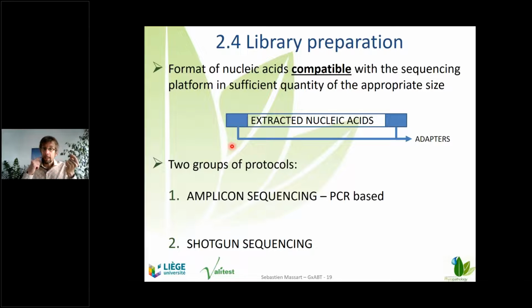This is done, for example, for microbiome studies. If you want to study the bacterial or fungal population, you will design primers that amplify a specific region: 16S for bacteria, and part of the 16S, not the whole currently, or ITS, the internal transcribed spacer, in fungi, for example, or COI for insects, whatever. You will amplify like a barcode and sequence it. So you generate a PCR product and you sequence it.